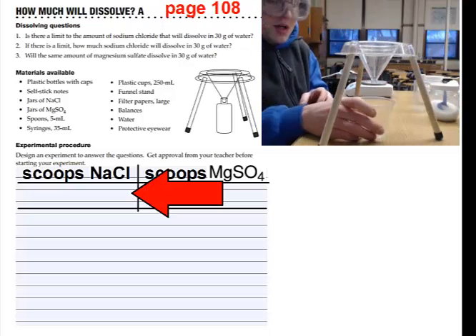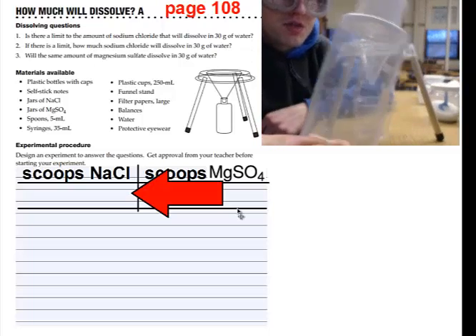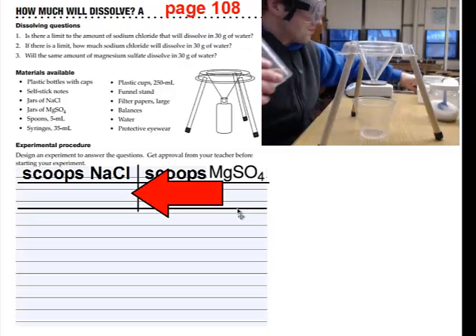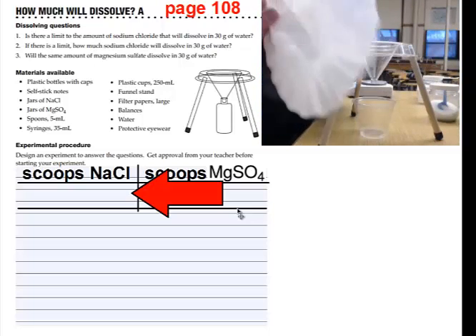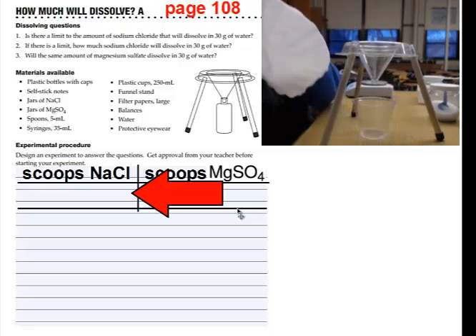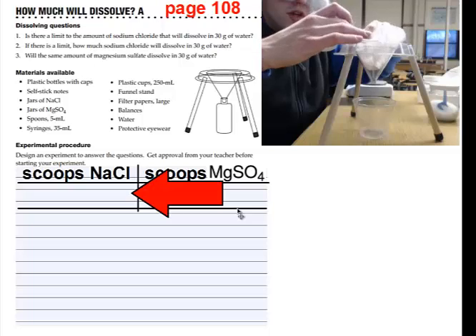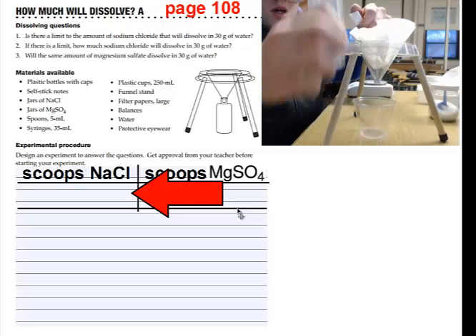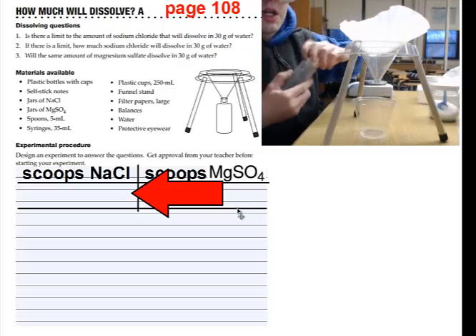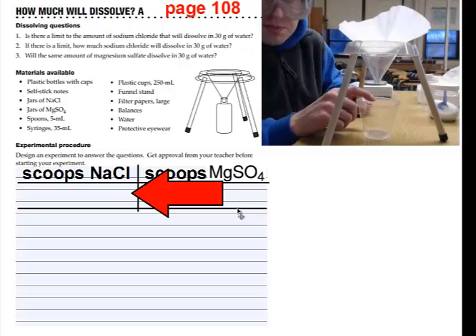and place the empty cup underneath the cone, and then take your bottle of sodium chloride and water solution that has been saturated, and you're going to take a coffee filter. Instead of filter paper, we have coffee filters, and you should take one, and your job is to place it into the cone, and then open your bottle and dump all the liquid and sodium chloride into the filter. It should filter through, and you want to collect the liquid, all the liquid, in the cup underneath.